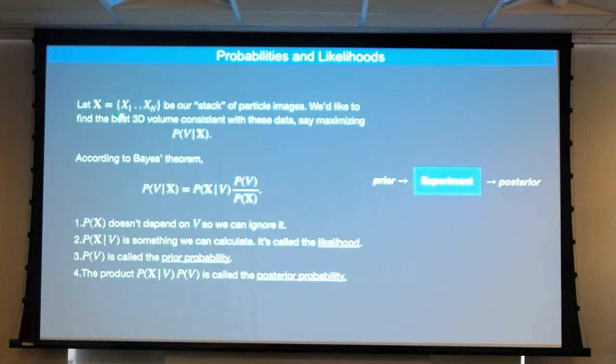capital X be our entire stack of particle images. And what I like to do if I'm going to do a statistical estimation problem is I want to find the volume that has the highest probability given my data set. So in the set of all possible volumes, I want to find the particular volume map that has the highest probability of coming from my data set.